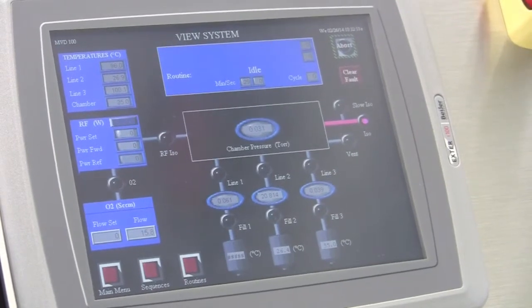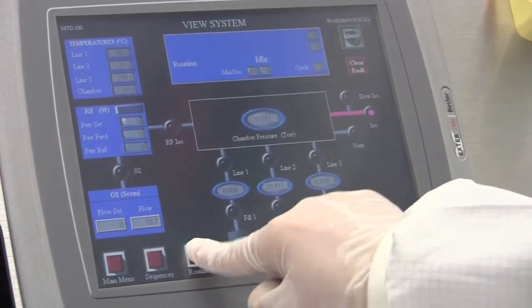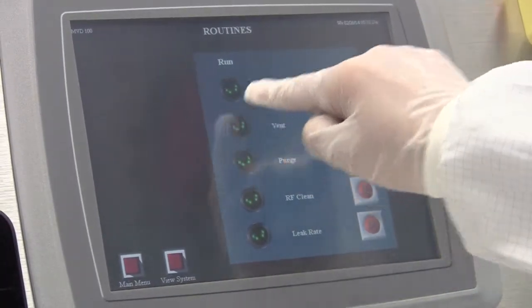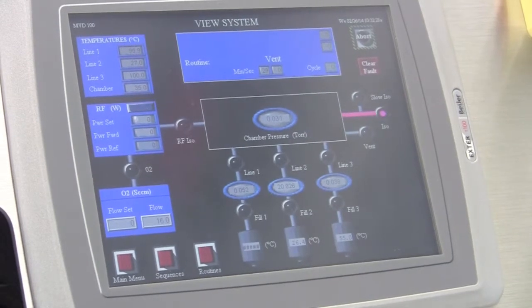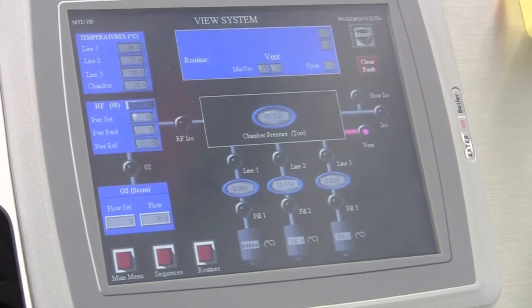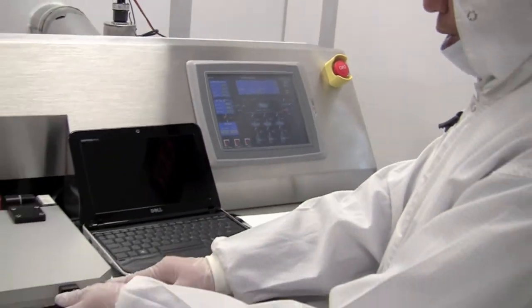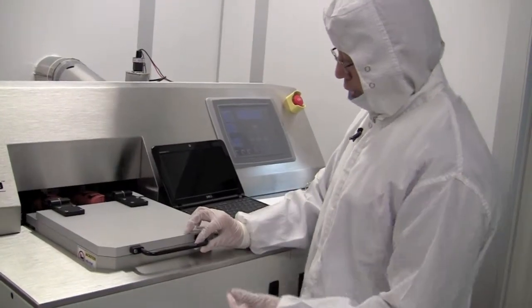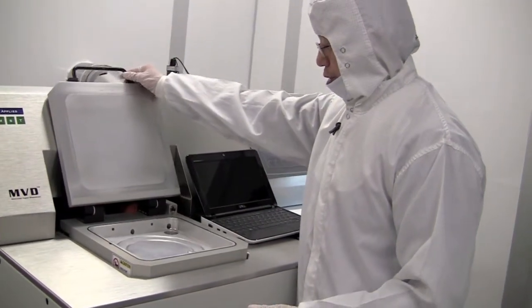When the system is at idle mode, we go back to the routines and vent the chamber. And the nitrogen will come in again to vent the chamber. We have to wait a little bit until we hear the hissing sound here. So we hear the hissing sound. Now we can open the lid to load the chamber.